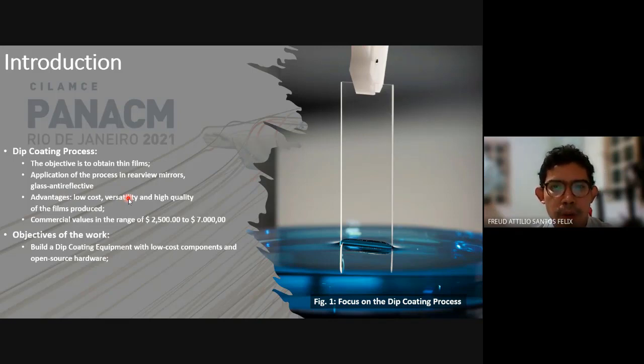When we looked at the equipment used for developing this kind of films, we saw that some parts are hard, which is related to the price range, which is based on 2,500 dollars up to $7,000. And here in Brazil, equipment starts at 5,000 reais.